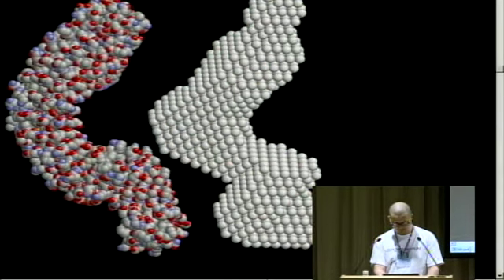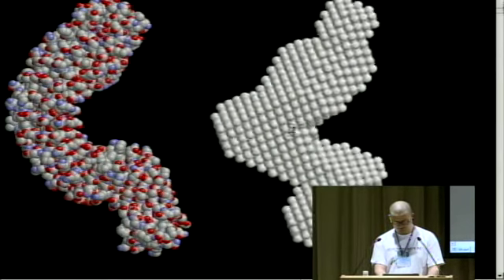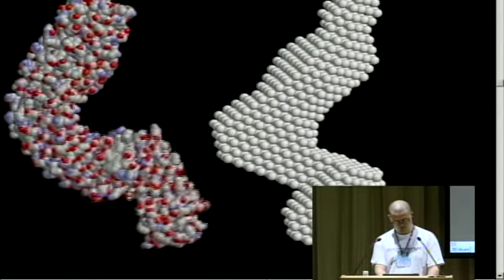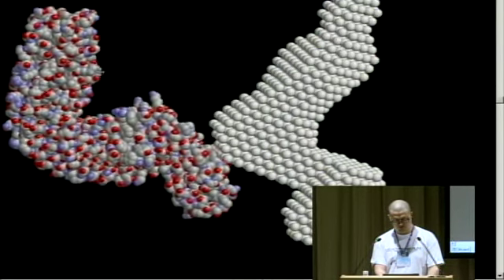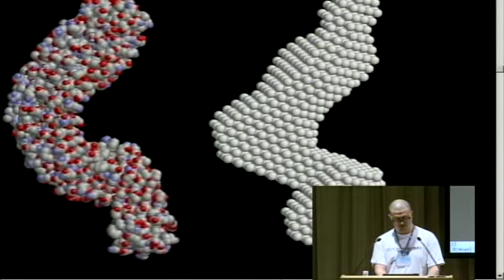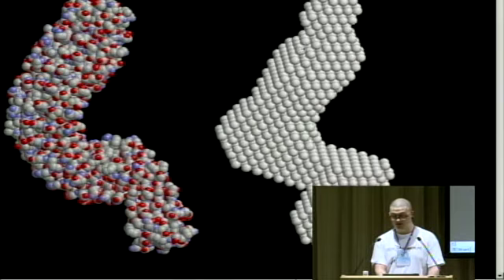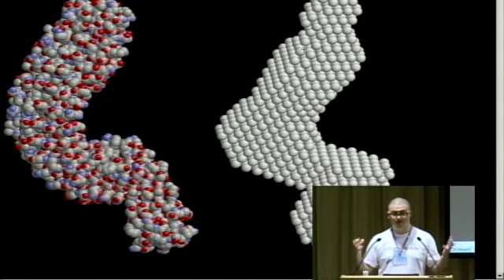Oh my God, look at this. He actually managed to reconstruct the shape quite well. So again, this is high-resolution data from the X-ray crystallography, and this is the ab initio model that we constructed directly from the small angle scattering data from a sample that was randomly oriented in solution. Isn't that amazing?